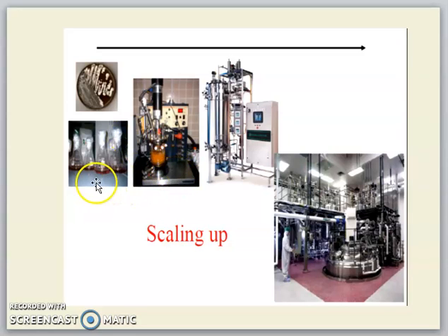The shake flask is still in the lab scale, but in the lab scale we also have a bioreactor, but in a small volume. Then we can have a pilot scale, a larger volume compared to the lab scale. And then later we can have the larger scale, the commercialization scale of reactor, in order to produce our product in a large amount to be marketed.